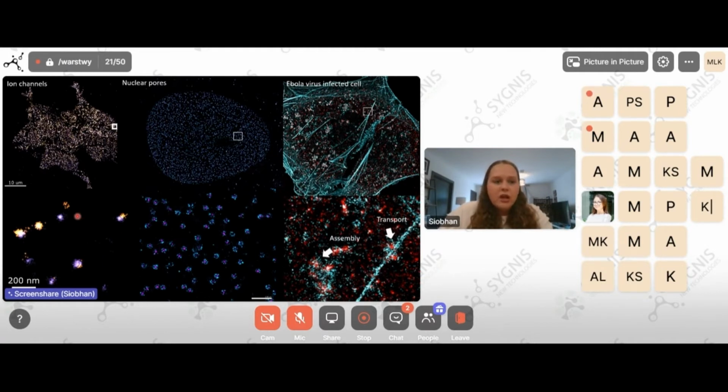But additionally, through high resolution techniques, we can gain an understanding of the interaction of these ion channels. We can see if these ion channels are spatially separated, as you can see here with the isolated blue and gold signals, but we can also start to see the ones that are interacting with each other. You can see that there are some cases where the gold and the blue signals are co-localizing. So it's at this level that you can see the single ion channels, but you can also assess their spatial distributions and their co-localizations, which would just not be possible with wide field.